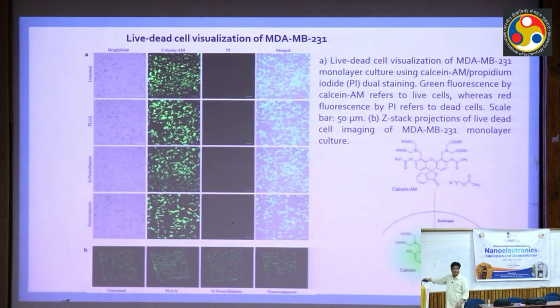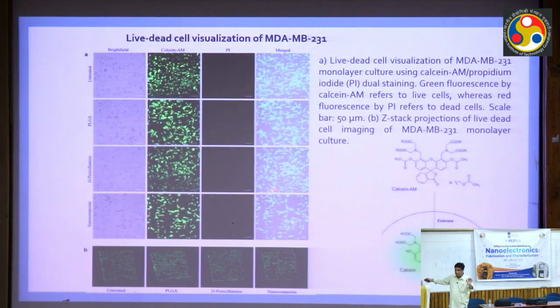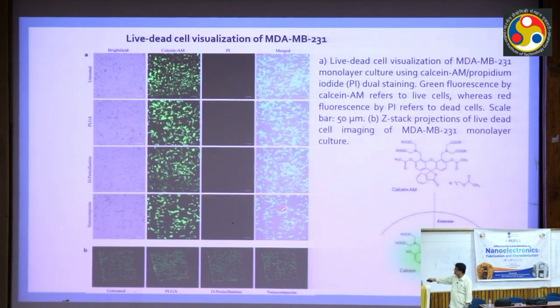I can see my eyes are not as good as your eyes. You will be able to see better, right? Because of the resolution, because of your power. So you see the red color over here. If you merge these two, you see the red versus the green. If you are not able to see, don't blame me. You blame the projector or your eyes.